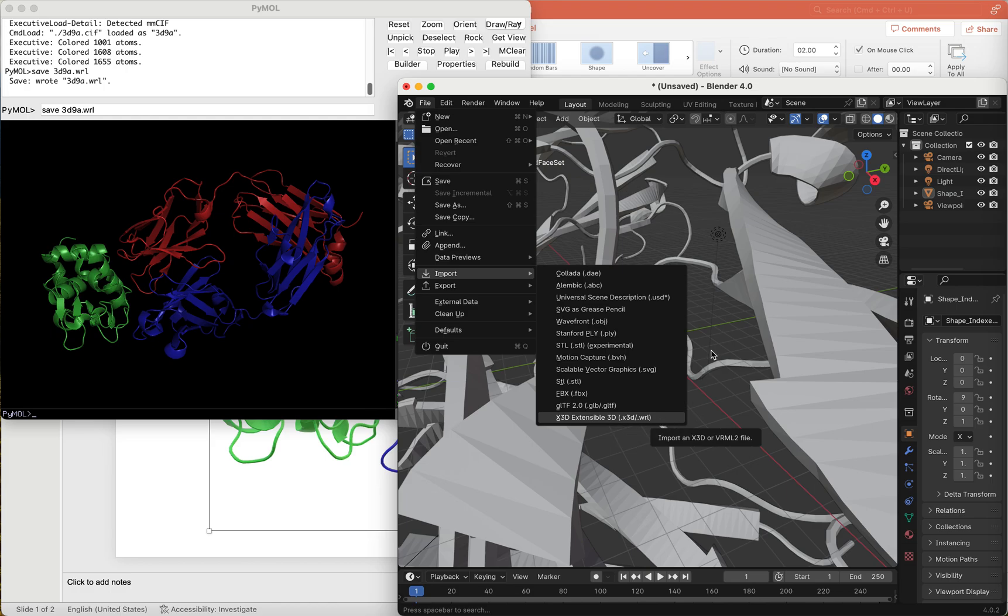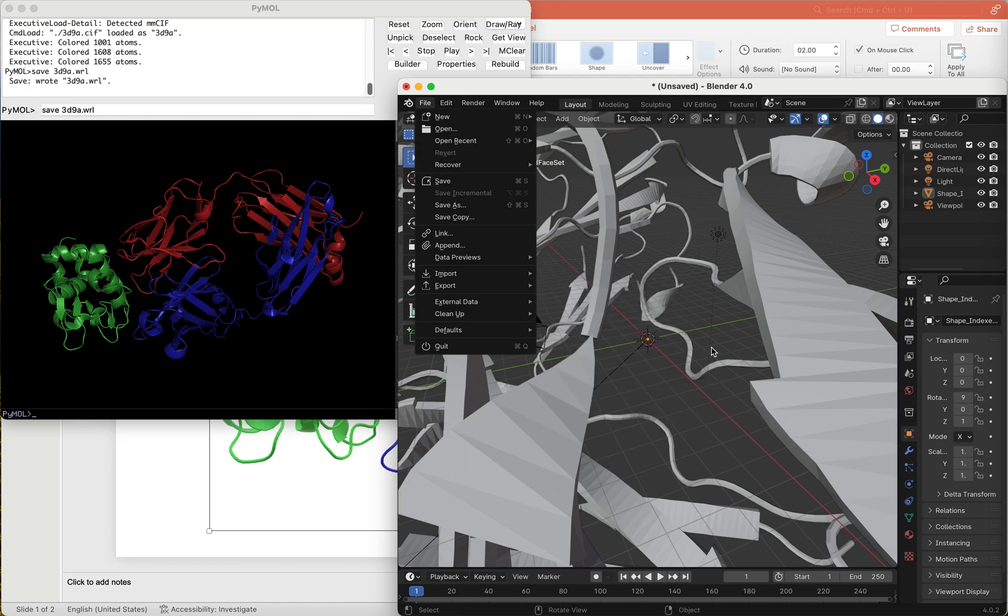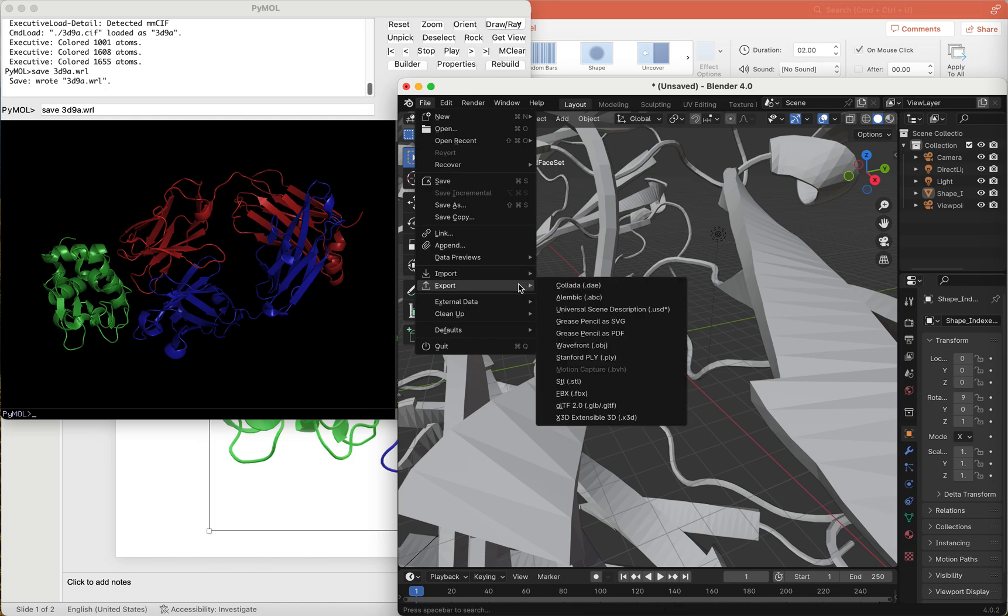Once the 3D object is in Blender, then we can export it out as another file format by choosing Export, glTF file format with the extension .glb.